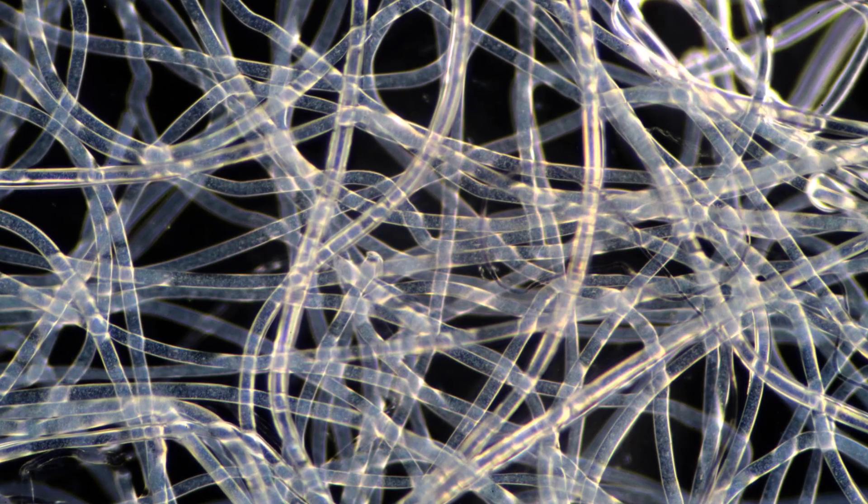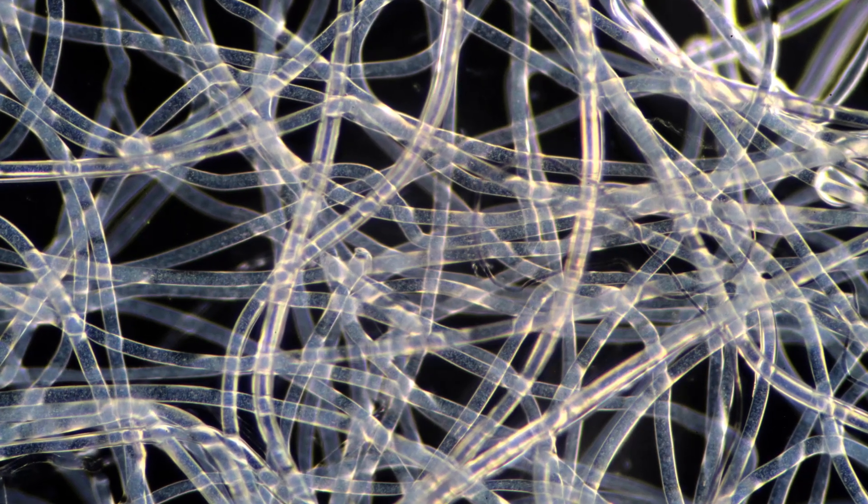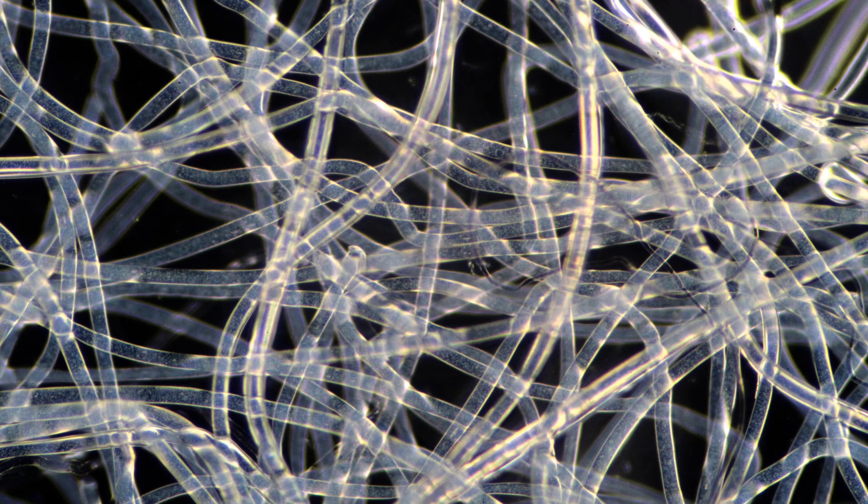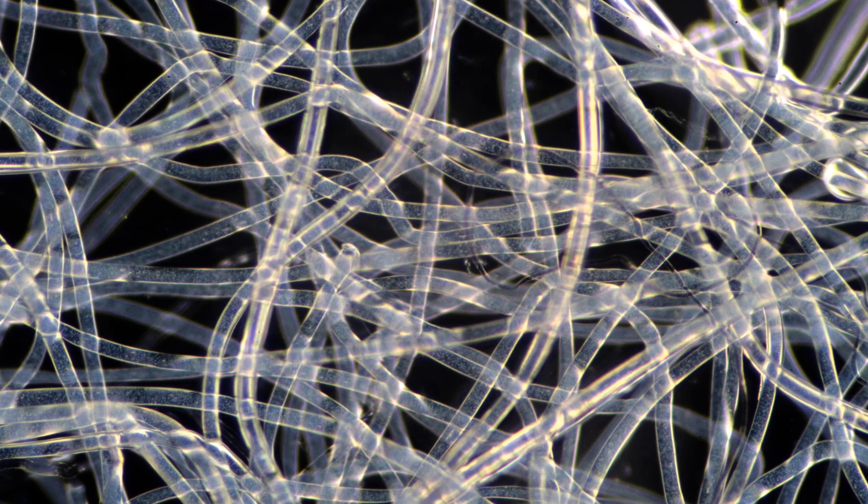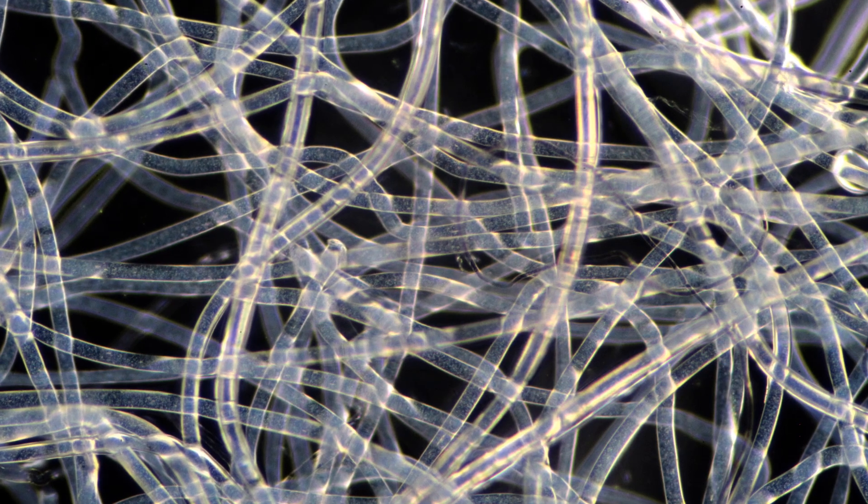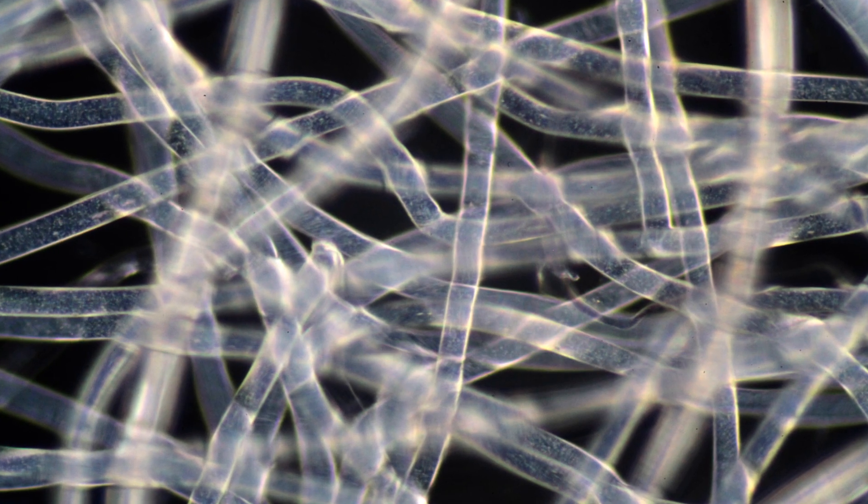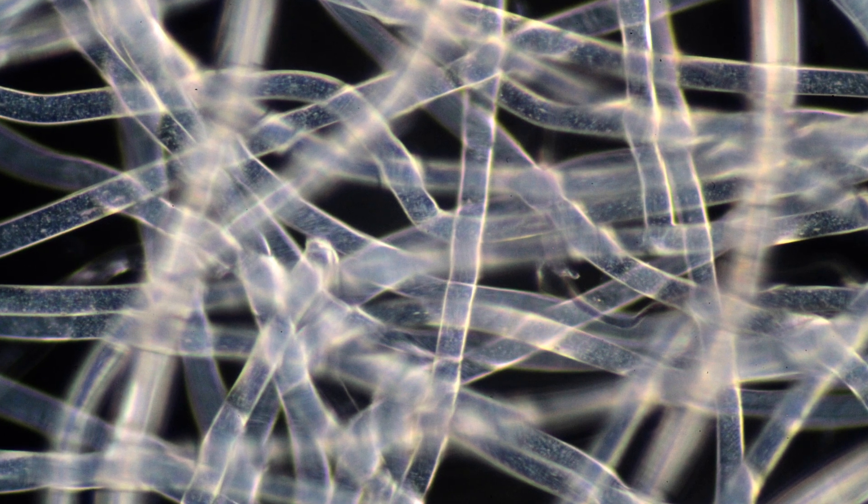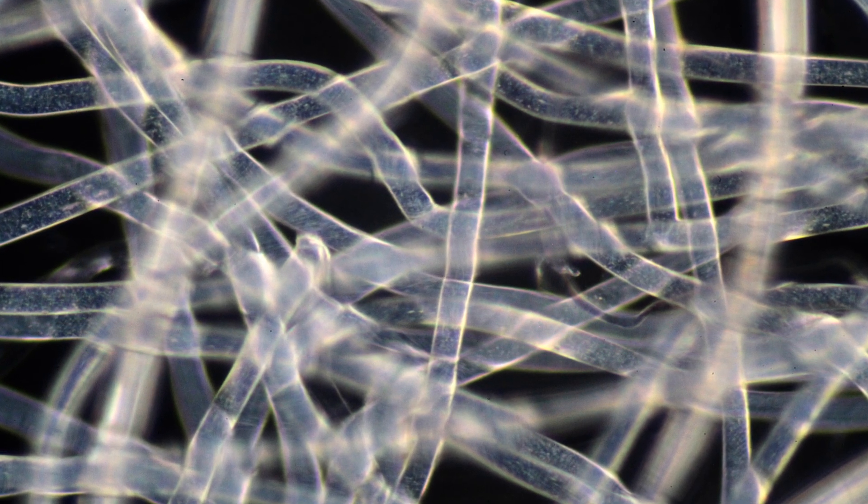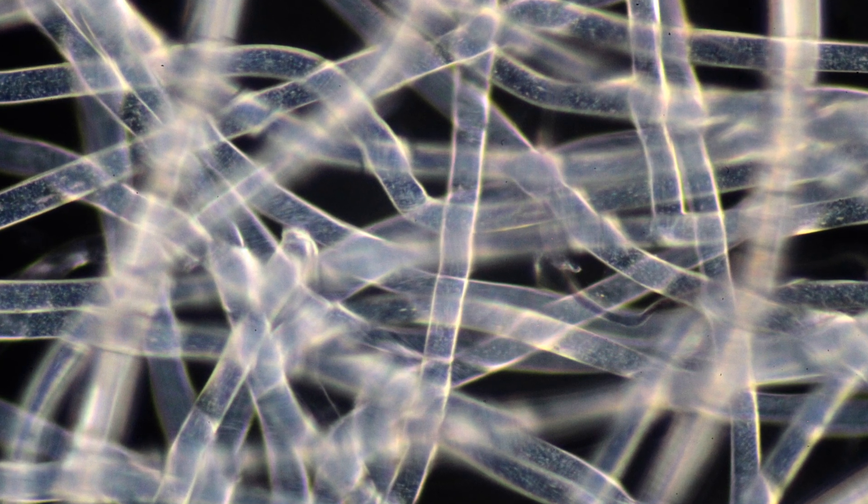And finally, some still images, a little bit color corrected using Photoshop. But these are the fibers again, and I made the background a little bit darker. And you can see that they're quite nice and transparent using the 4x magnifying objective and then 10x magnifying objective. The total magnification, of course, is much higher on screen and also depends a little bit on your screen size and a variety of other factors. So that's it for today.